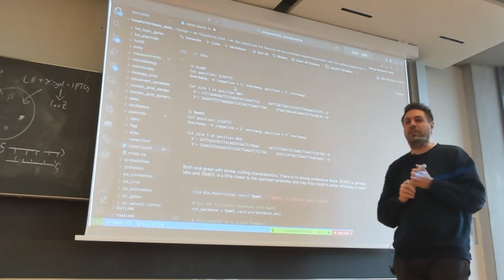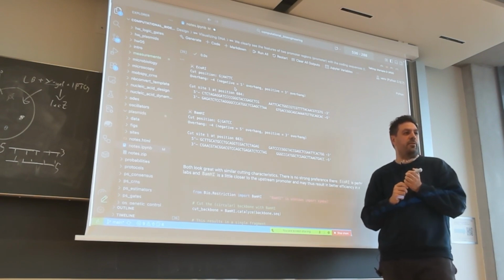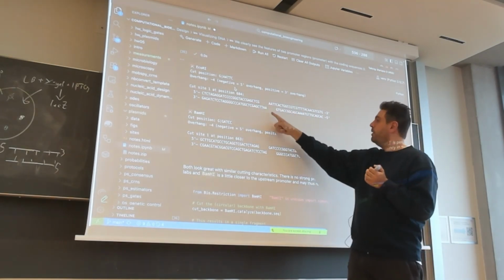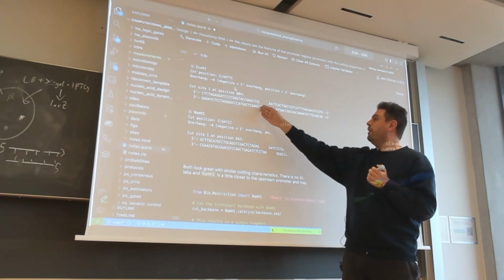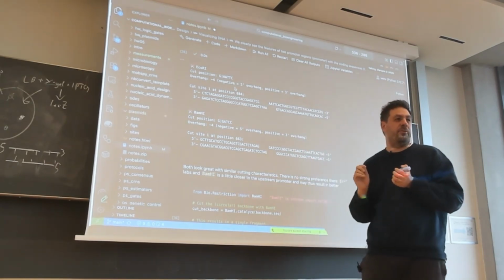Remember there was a 5' exonuclease in our Gibson mix. What is a 5' exonuclease doing? It eats from the 5' end, which means it starts eating to the inside. So even if we cut blunt here, a few seconds later we would have been eaten inside anyway. So it's not a big deal.